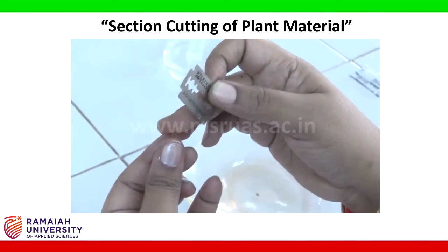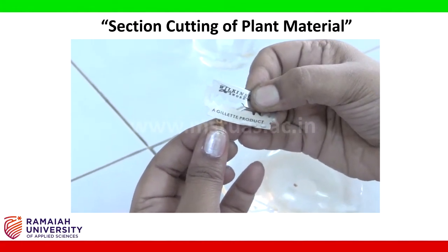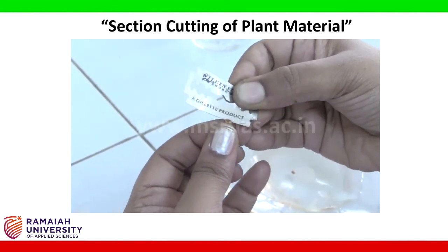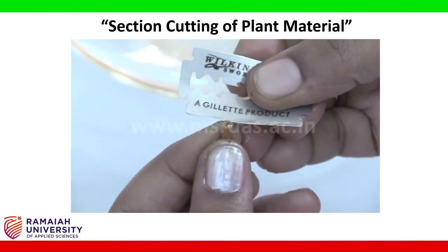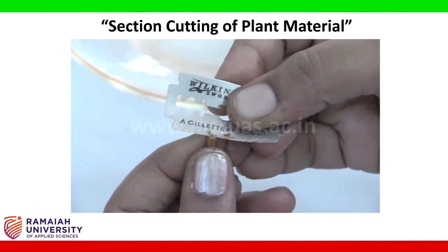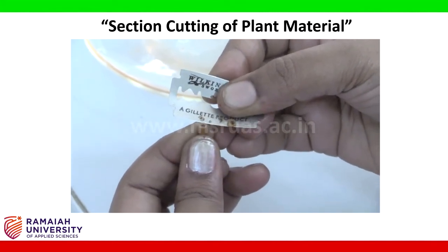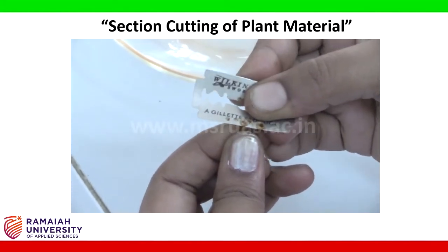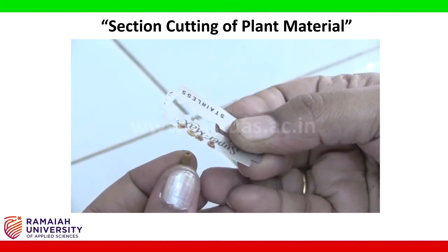So hold the material gently. Now move the razor front and back. Now we have taken 3 to 4 sections.